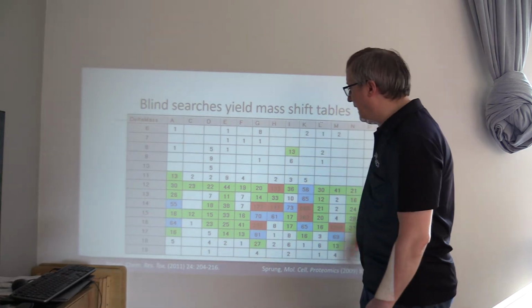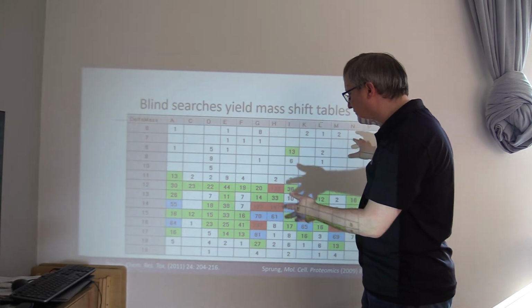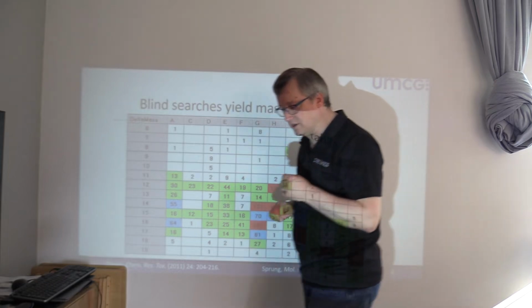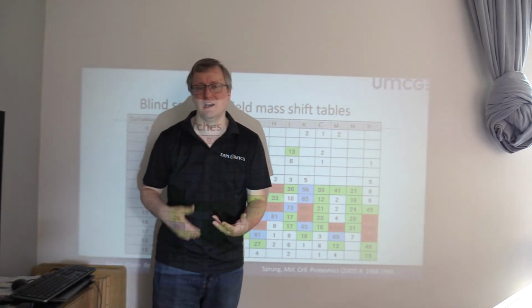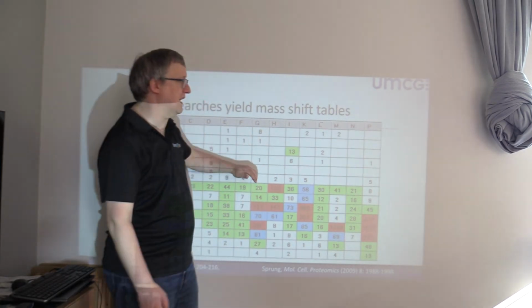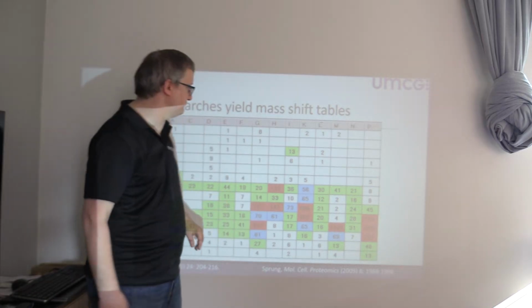Now, what we're looking at is a very broad look at a bunch of data from formalin-fixed, paraffin-embedded tissues. These have been problematic because they bear a lot of modifications structurally. The way that the samples were preserved has created modifications to the proteins in bulk.